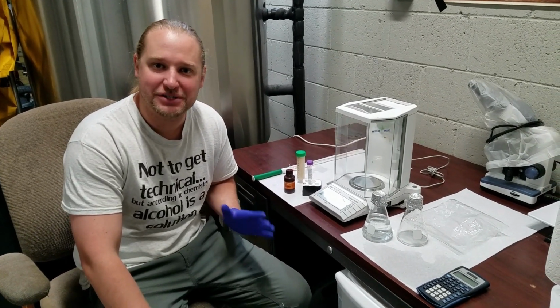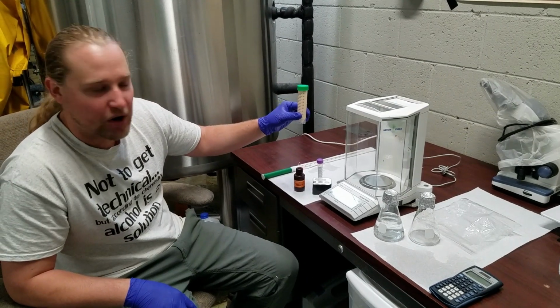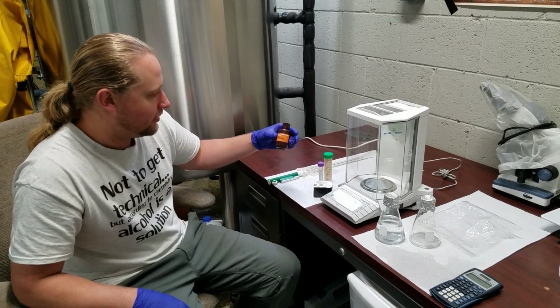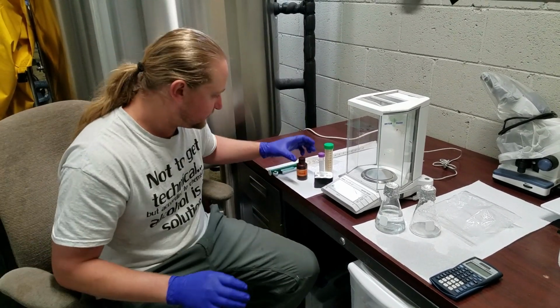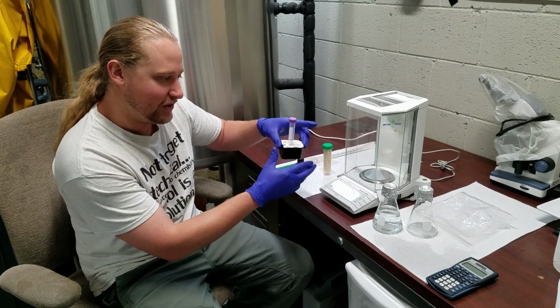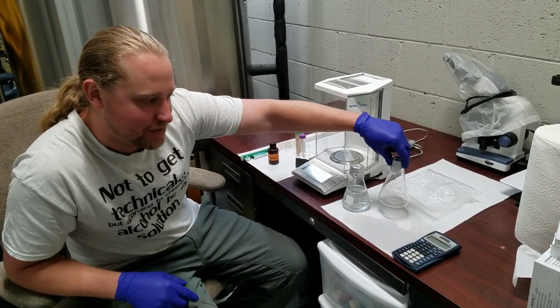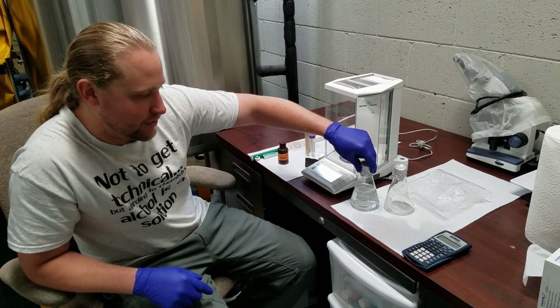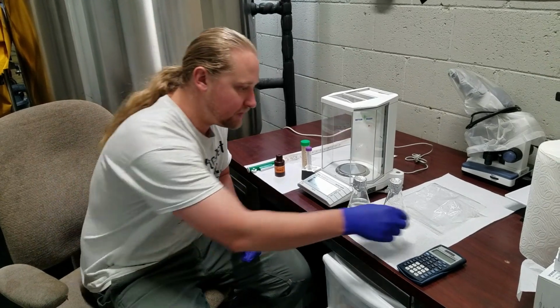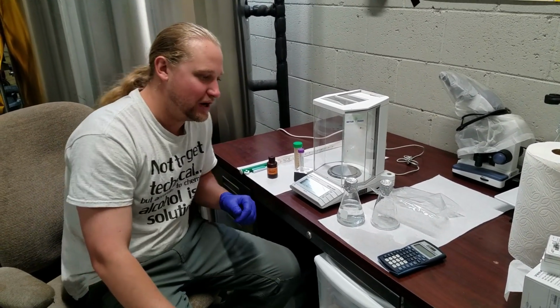So the equipment you'll need to do this weight dilution, let's just go through it here. We have our uniform sample collected from our brink here. We have a 10 milliliter pipette and a pipette pump. Alkaline methylene violet is our stain we're going to use. We have a 15 milliliter centrifuge tube and a little holder I just made for it that I can use to put on the scale. Our Mettler Toledo balance here, an empty 250 milliliter Erlenmeyer flask, and then an Erlenmeyer flask with a little bit of water in it, dechlorinated tap water works fine. We have disposable 6 milliliter pipettes and a calculator. So those are the things you'll need to do this dilution.